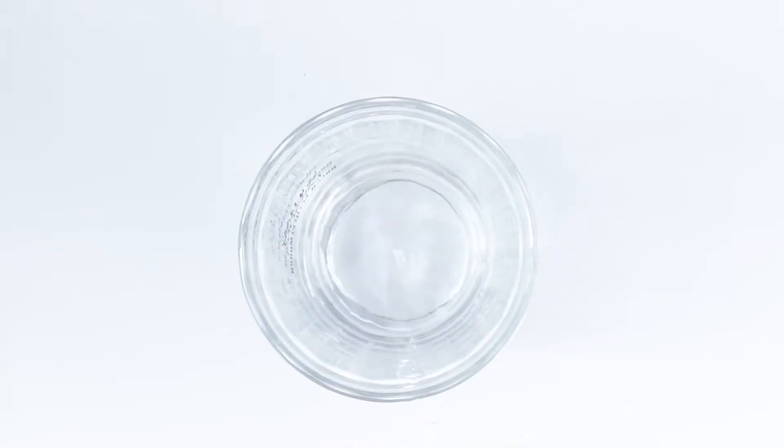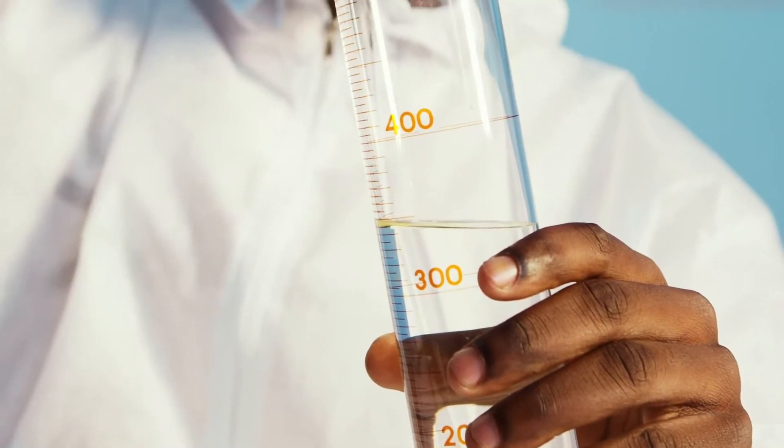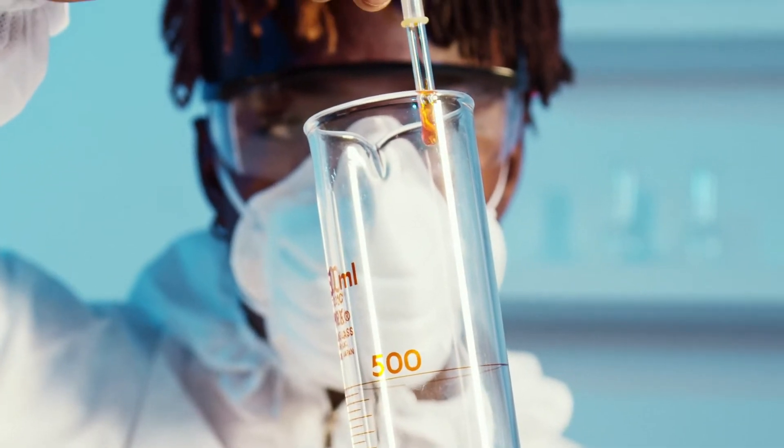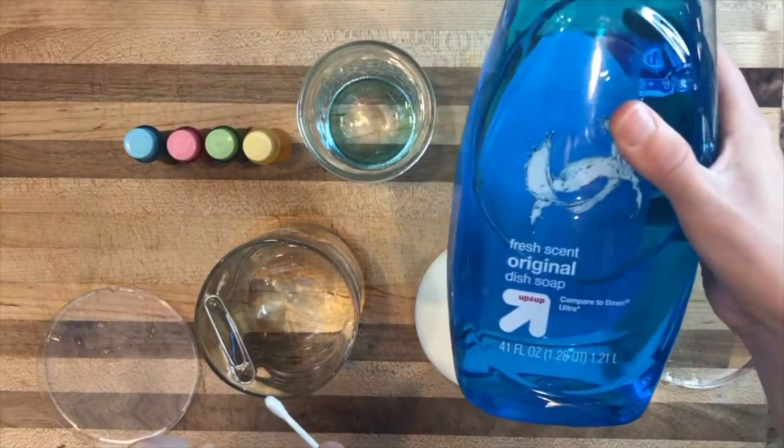Number four, if you're getting students used to scientific measuring tools and getting them started with properties of water, you can do a very simple water lab looking at things like cohesion, adhesion, and surface tension using just beakers, graduated cylinders, water, soap, cups, and paper clips.